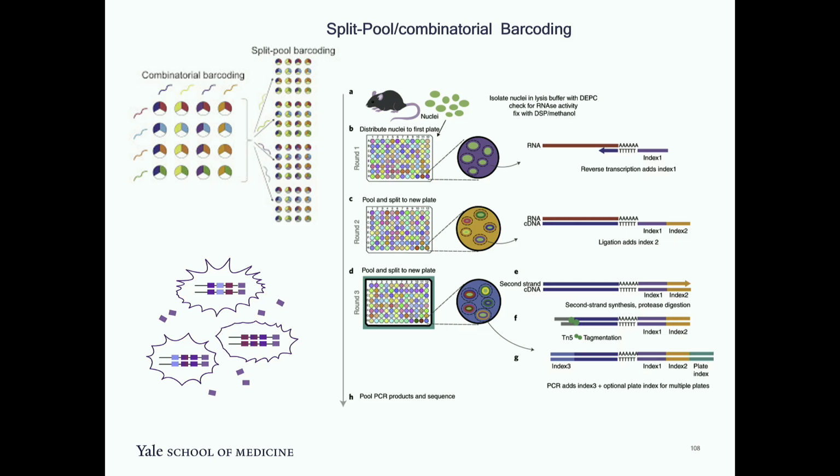So at some stage they are actually doing the lysis. Okay. So in the split pool strategy, what they are doing is lysing at the last step, but the reagents can go inside the cell. The cells are permeabilized and then the reagents go inside, and you can do in situ RT-PCRs. That is essentially what they are doing.